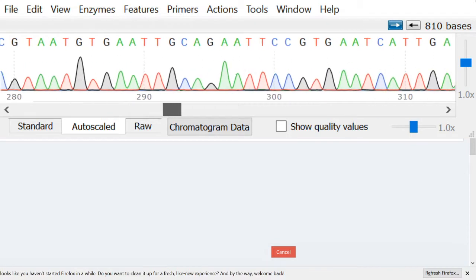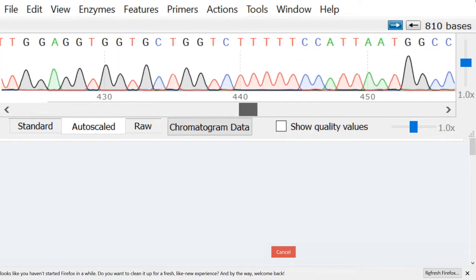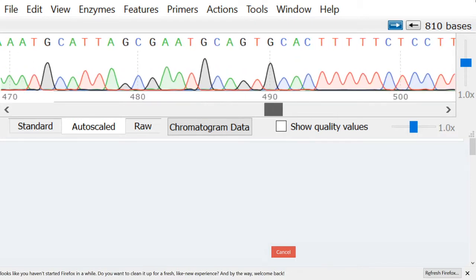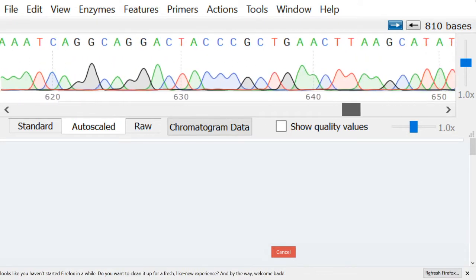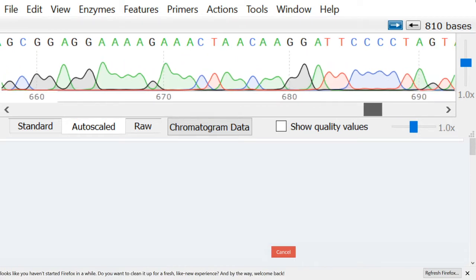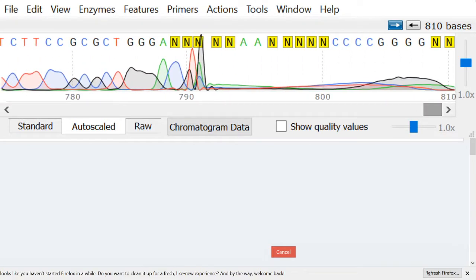This read looks really good so far. The primers I used in this are ITS1F and ITS4B. 1F stands for fungal, so it only amplifies fungal DNA. And the 4B stands for basidiomycete. Basidiomycetes are a group of fungi that the mushrooms are in, which means it ignores mold DNA or any other weird DNA and pretty much only amplifies mushroom DNA. So that gives us a read that's almost 800 bases long.